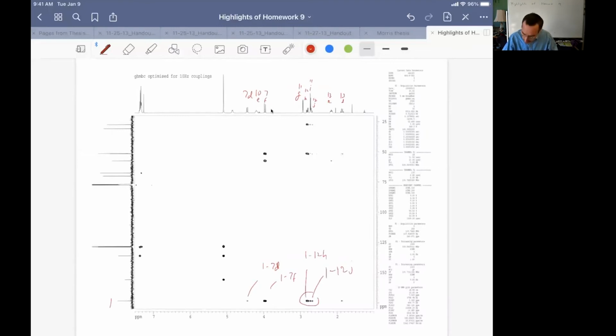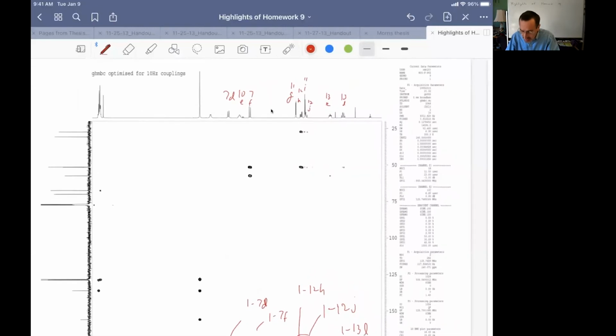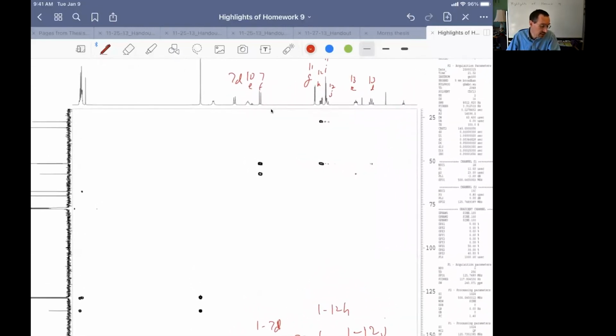And we have one little more weak one with 13L. And remember, with the exception of isolated methyl groups, the absence of a cross peak or a weak cross peak doesn't mean it doesn't connect, because your J values depend on dihedral angle, particularly for your 3-bond J values. And as I said, we're going to struggle to place those isolated methylenes.